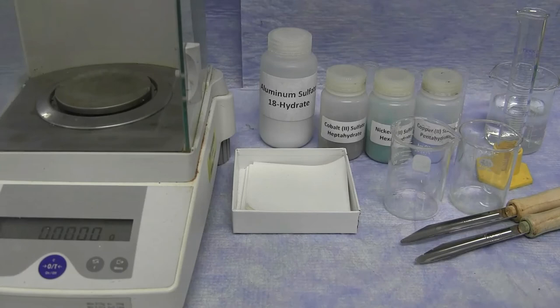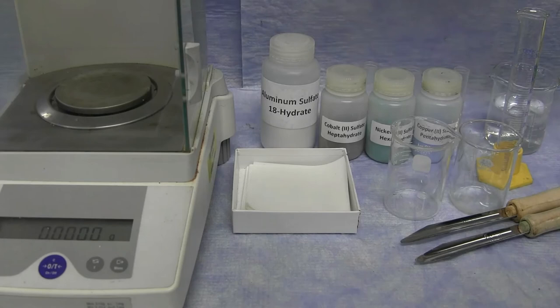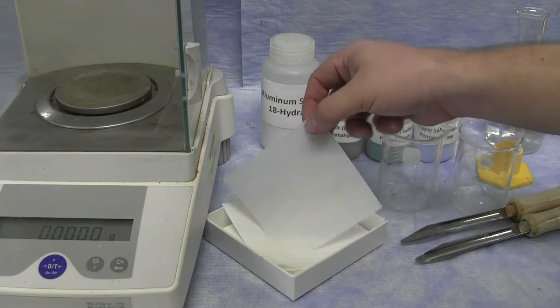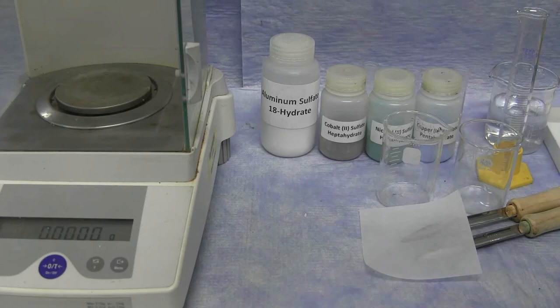This part of the experiment involves preparing solutions from solid salt compounds. You'll be preparing two solutions from solid material. One solution of aluminum sulfate, and one solution of either cobalt sulfate, nickel sulfate, or copper sulfate. For each solution, you'll be weighing a mass of the solid powder and dissolving that in 50 milliliters of water. You will be weighing between 1 and 2 grams of each solid powder. A useful lab component is weighing paper, which you can use to weigh the solid material. Solid material should never be placed directly on the balance pan itself.